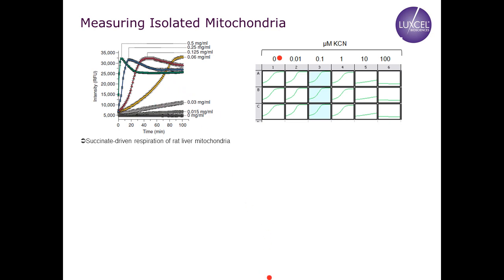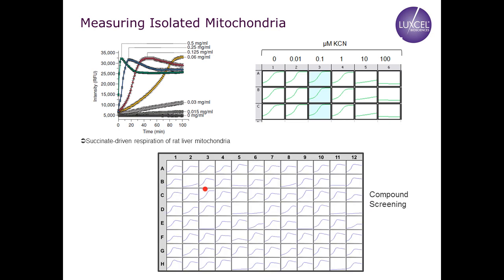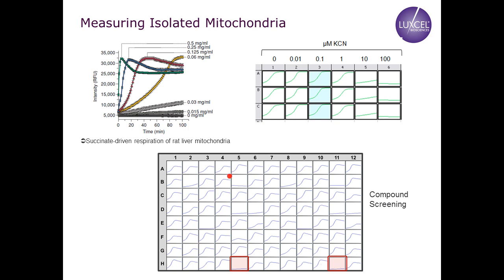So when one is screening individual compounds, you've got a plate map that you will view the data on any of the plate readers that would be doing the measurements, and Wendy will go into this in much more detail as to how the instrumentation is outputting those systems and how they're optimized on the BioTek measurements. But this is just an example of 2 wells measured in duplicate, and that's identifying an inhibitor. And you can see on the plate there are lots of other inhibitors flagging. And this is specifically looking for inhibitors because we're looking in the presence of ADP. So that's an example of how MitoXpress-Xtra can be used to assess mitochondrial function, and by extension how it can be used to screen for the mitochondrial liabilities of a panel of compounds.